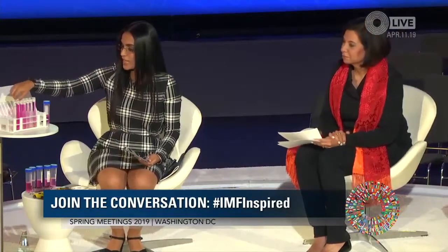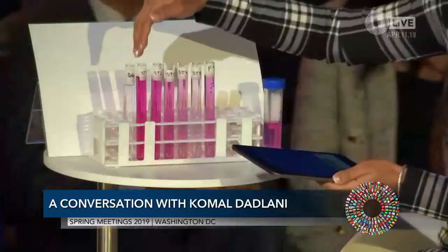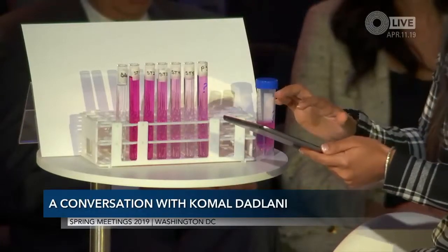We've got known, standard concentrations, and with the colorimeter in Lab for Chemistry, we're going to calculate the unknown concentration. We'll take a picture of the solutions: standards 1, 2, 3, 4, 5, with known concentrations.